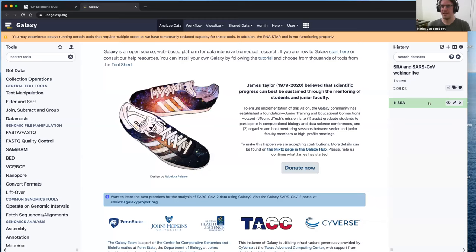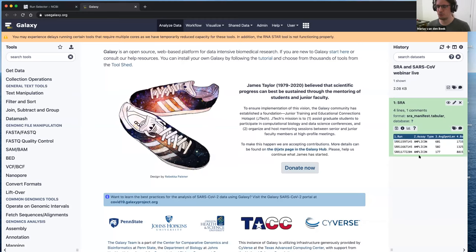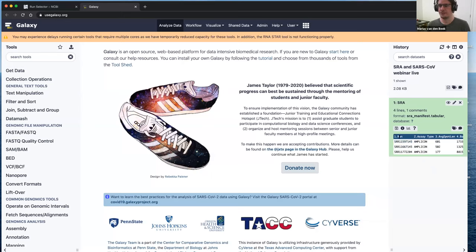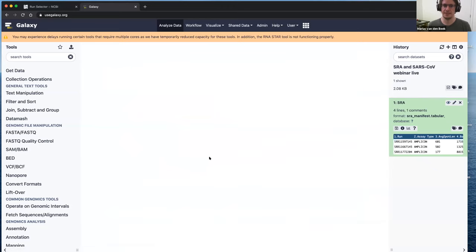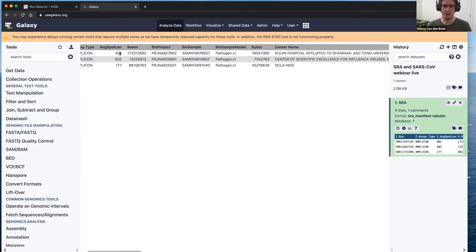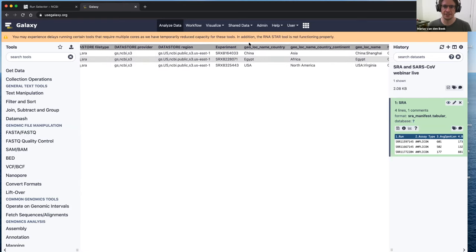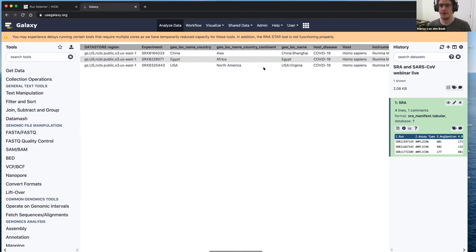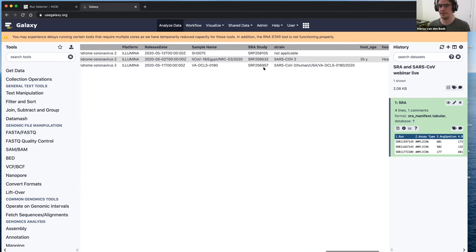Marius here. I've done the same thing Dave just did — selected three datasets, which is what we have in the current version of the tutorial. This is the metadata we got from the SRA. You can see a small preview, and if you click the eye icon, the dataset will load. The first column is the run accession — the most important thing we're interested in — followed by all the metadata we already saw in the Run Selector, now within Galaxy. These datasets come from three different countries, which is why I picked them.